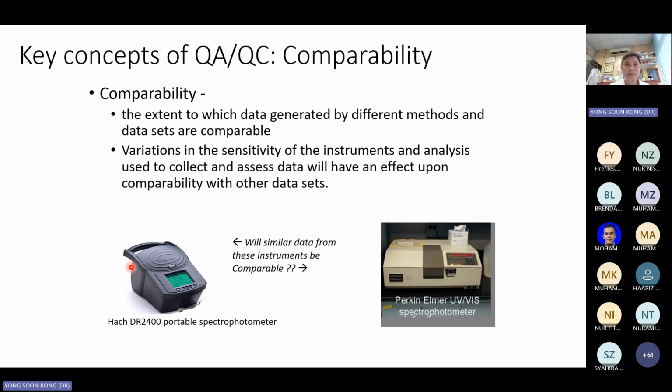So in a way that these are the things that the QA and QC team together with the water team need to consider. You can do both. You can bring your sample back to the lab, but are those degradation time significant to affect the accuracy? If it does, then you have to pick a lesser capability equipment and you have to analyze on the spot. It's even better that you can analyze on the spot, because sometimes things can change very quickly. So these are the options that you want to consider and you want to pick.